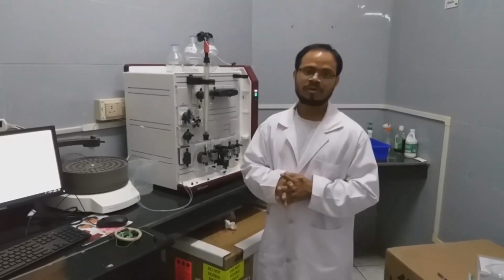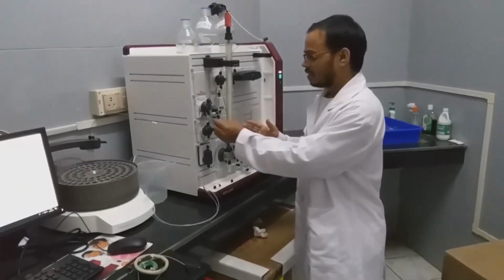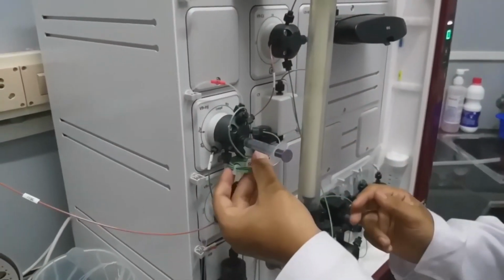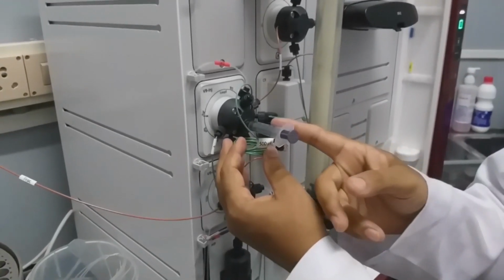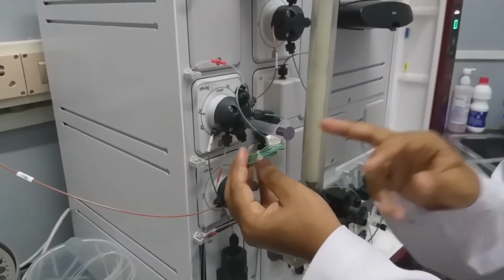So it's time to inject the protein solution and analyze it. For injection, this is the port where we are going to inject the protein solution, and this is the loop. Whatever we inject through this injection valve will be stored inside this loop.